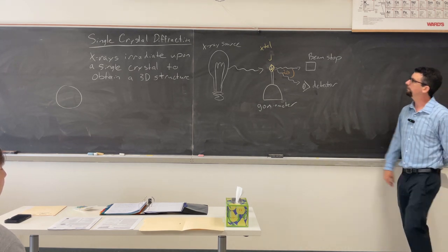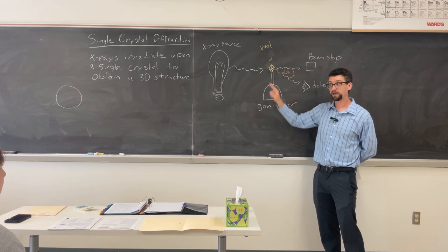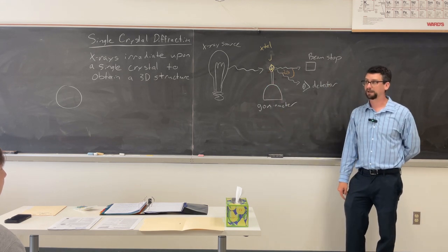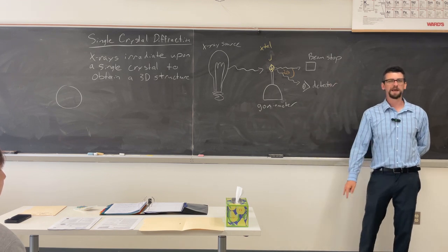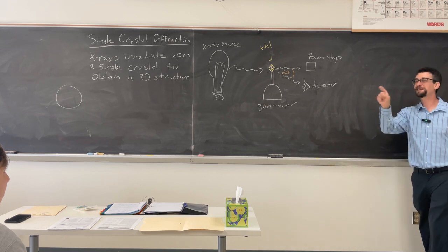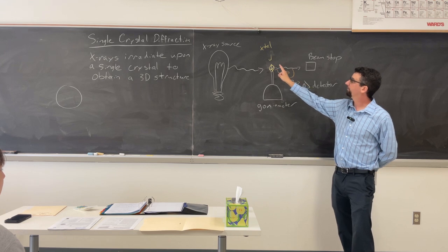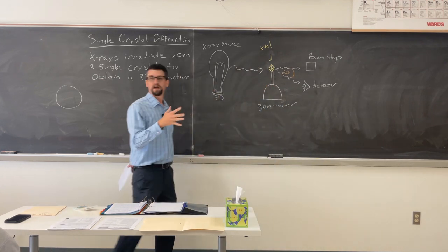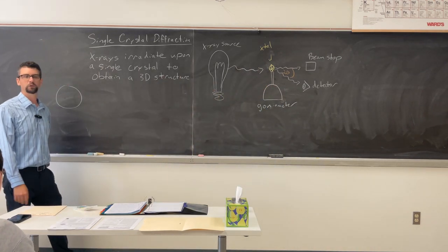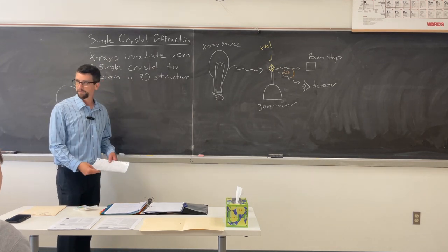What's going to happen is we keep irradiating this with photons. It's going to heat up. What do you know about lattice constants as you heat things up? Yes, most of the time. There are ceramics I wouldn't want to touch with a 10-foot pole. It changes, let's say that. Okay, now, what do you know about molecules as you heat things up? They're going to vibrate more. If they move around more, what happens to your resolution? Decreases. So, what are we going to do to stop that?